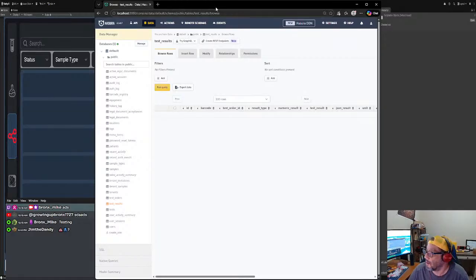All right. Remember, we're not gonna make any tests from the sample scene. The only thing that we're gonna do with the sample scene, remember, singularity principle, we are just gonna display the samples and everything that has to do with the sample, but we're not gonna create tests. That's where we're gonna draw the line, right? We're gonna be able to see tests. We just won't be able to create tests from here or do any results from it, right?